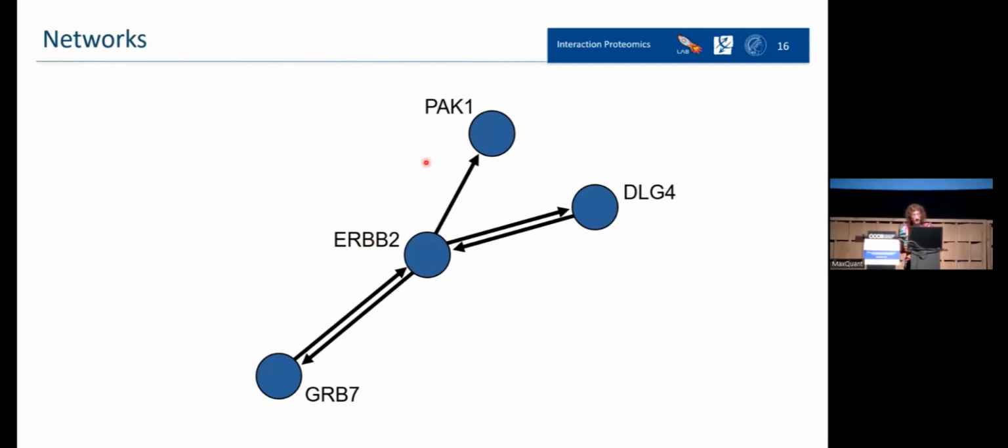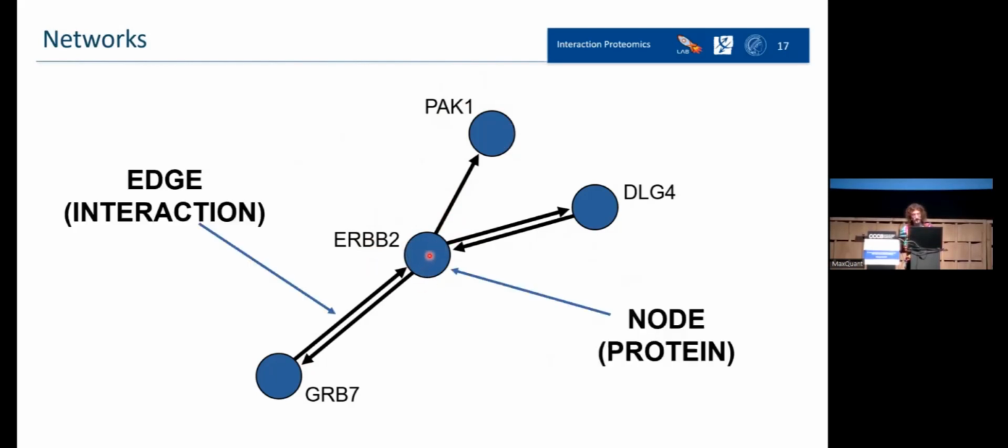So you can always add further information in this graph, also changing the colors of the dots, which are called nodes. So remember, the node is our protein, and the edges are the interactions. We can change the colors, we can put more information about how this interaction was discovered, and so forth.